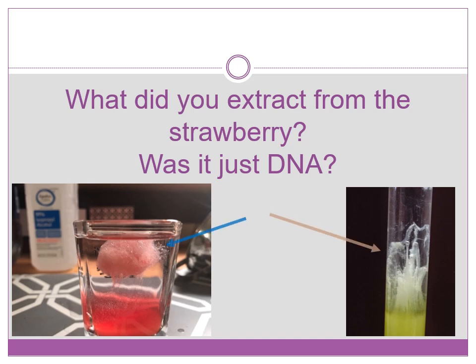Notice how they both have a colored solution on the bottom, which is what we refer to as the lysate. At the top, where it's separated from everything else, or starting to separate from everything else, where it looks like a cloud or thin wisps, those are what we refer to as the DNA, and it's also associated with protein.